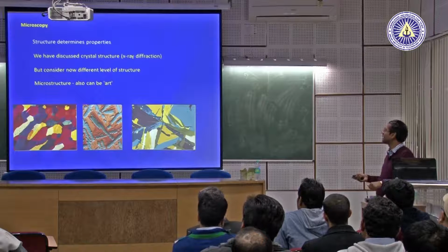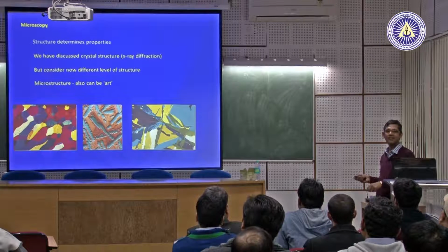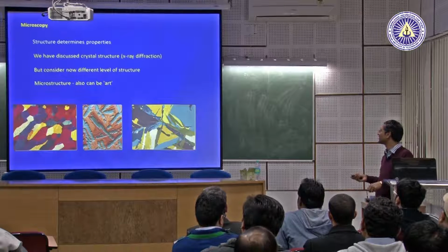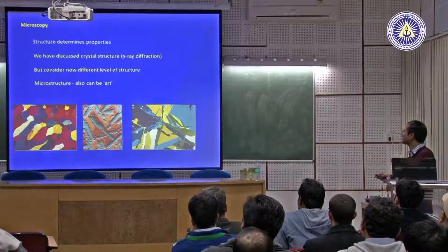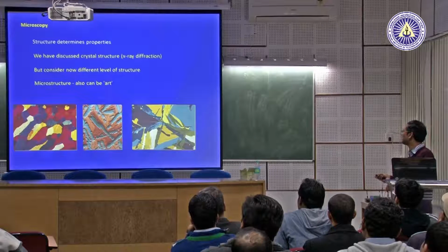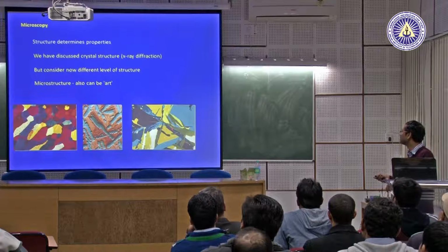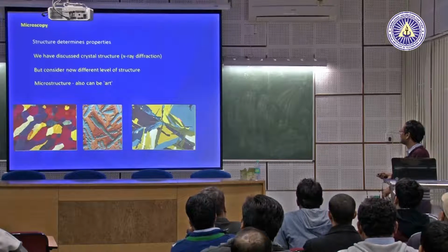This is done in SEM, where I think Professor Gurda will give a lecture tomorrow on EBSD, so I will not talk much about that. This is a modified metallograph using color etchant. This is again an EBSD IPF map.